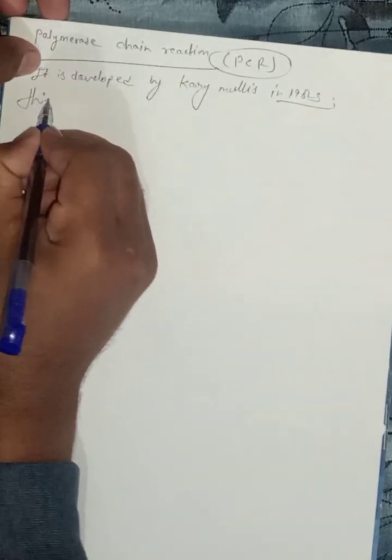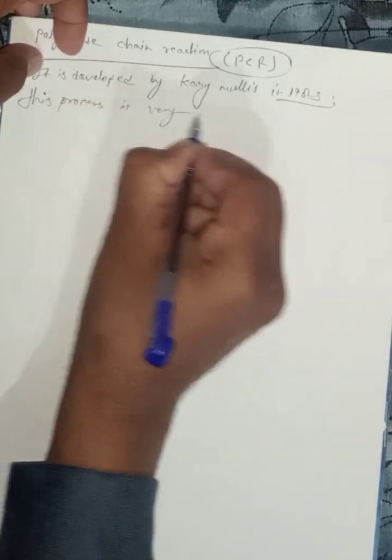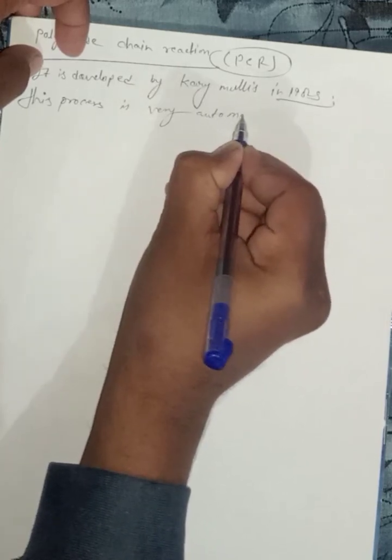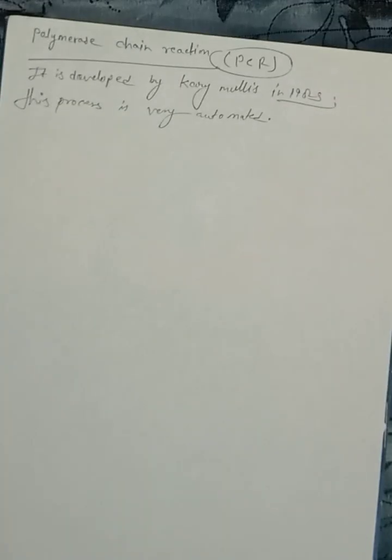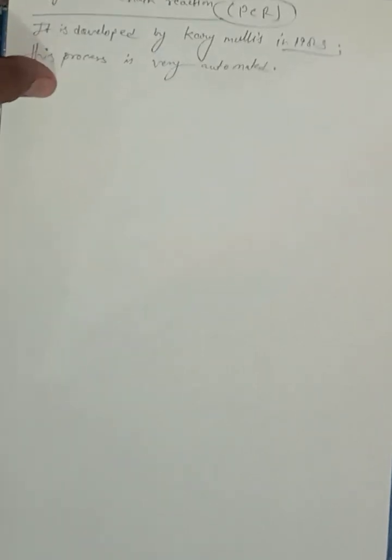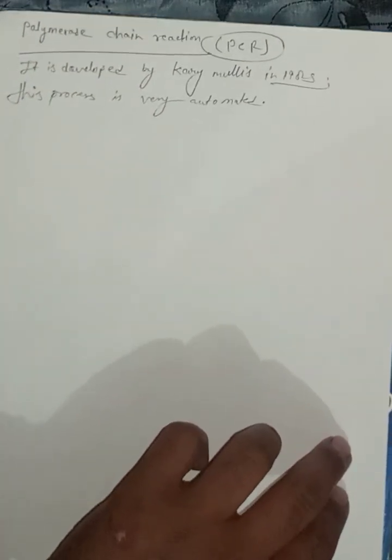The PCR process has been completely automated. Today I will discuss a little about this PCR technique, and next day I will discuss it briefly.